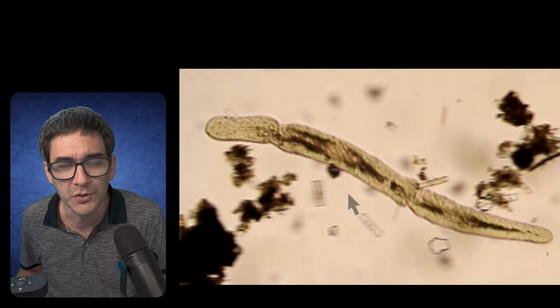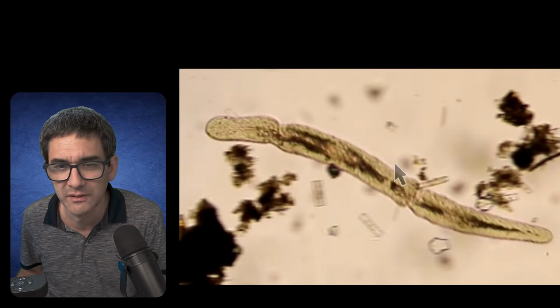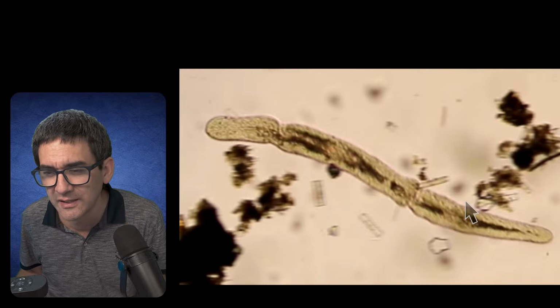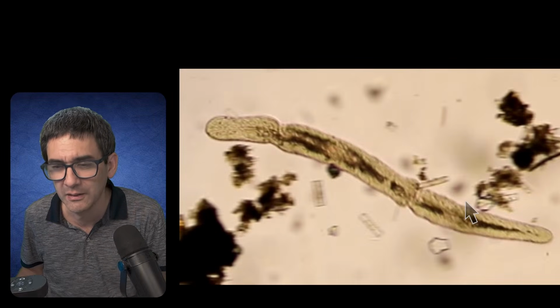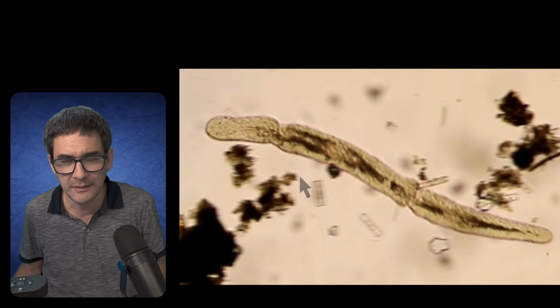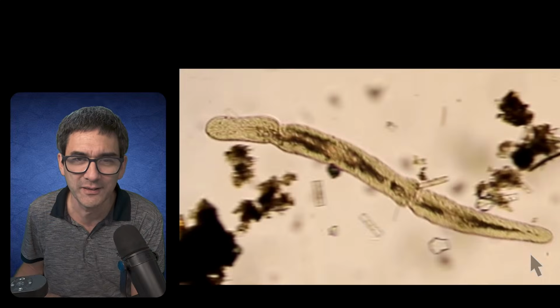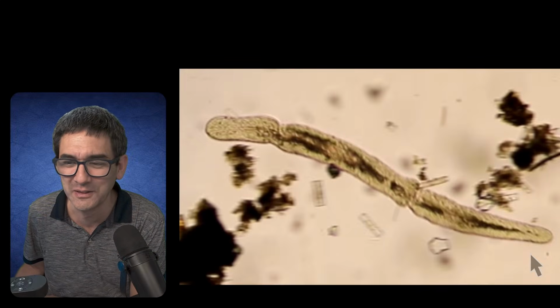Oligochaete worms have segments and some bristles, and so do polychaete worms, but this one does not seem to have those. Yes, it does have bristles. Okay, maybe you just don't see it here because it's a screenshot. But then on the other hand, there are so many different organisms out there in nature that sometimes you'd probably have to do a DNA test.